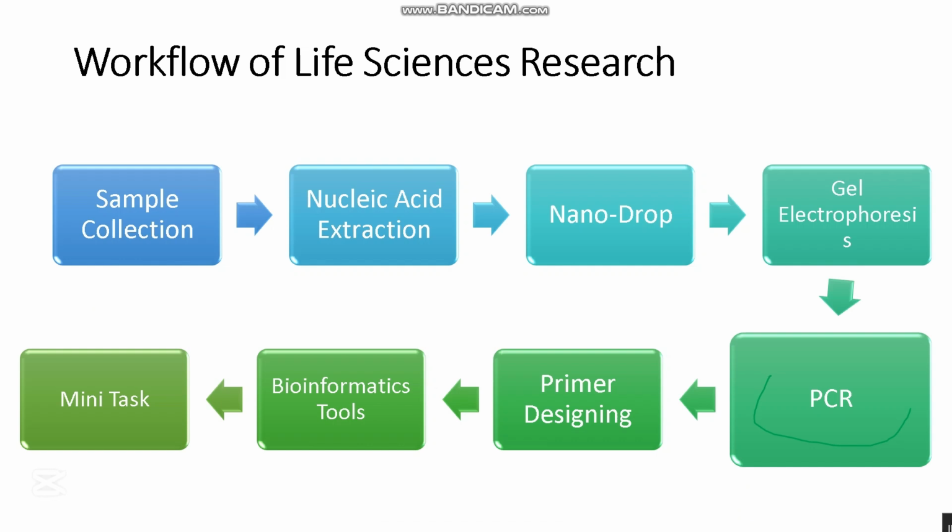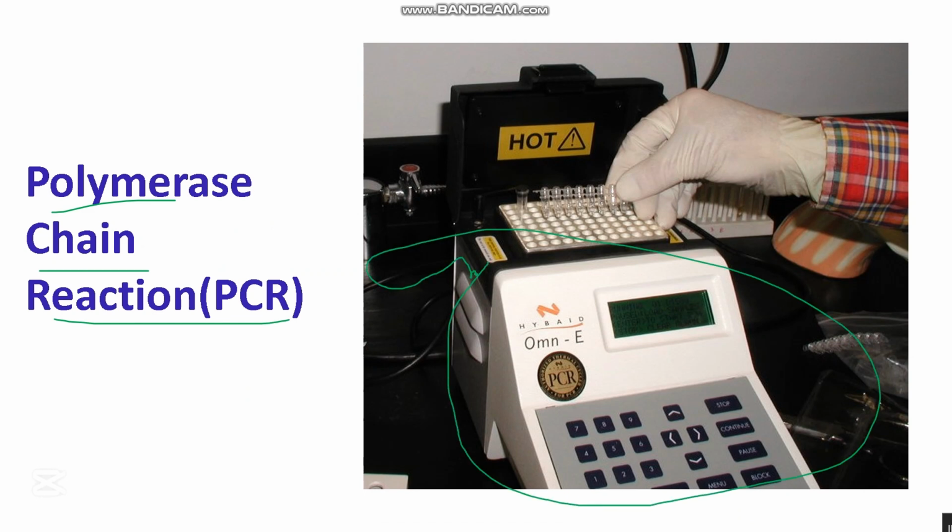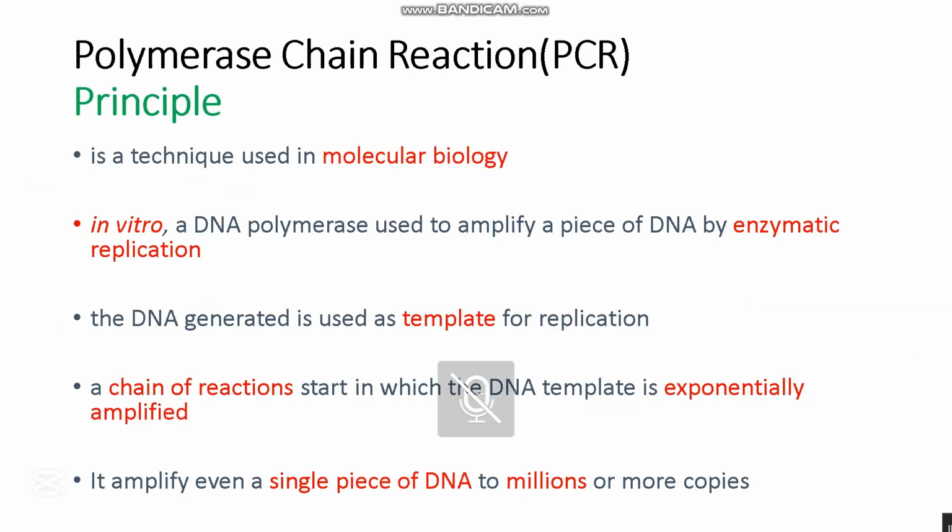Okay, now we're going towards the PCR, the polymerase chain reaction. This is actually the thermocycler. What is the principle of polymerase chain reaction? Sorry, what is the principle of PCR?